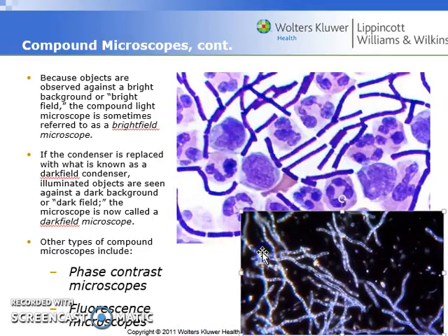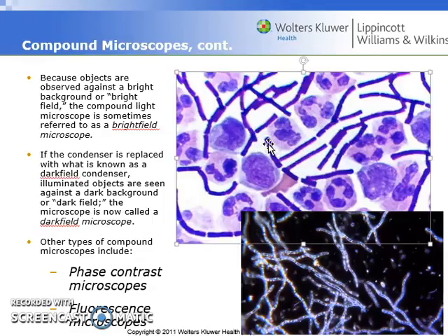And here's an image down here that would depict what you would see in the dark field microscope. Okay, so all these squiggly little structures, these are some spirillum bacteria that you see. And notice how the field in the background is all blocked out or provides a dark field. And so this image here is taken from a dark field microscope, whereas this image here is taken from a light field microscope. And again, that has to do with the background imaging that you see.